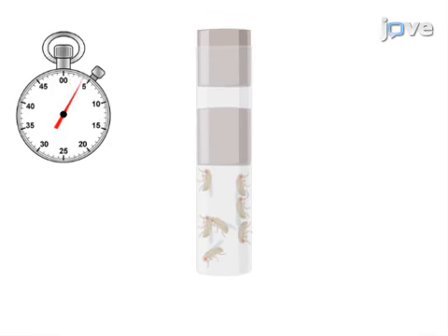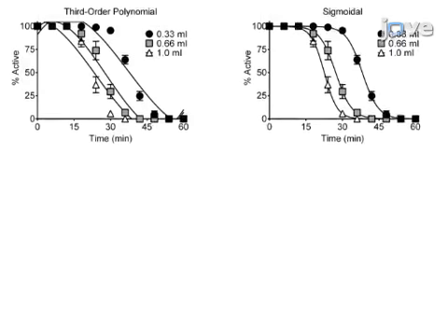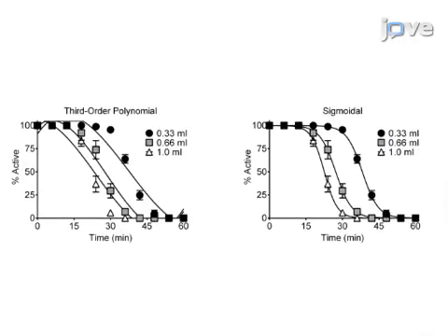The second step is to determine the number of flies that are sedated in each vial at recurring time points until all of the flies are sedated. Next, the time point is interpolated when 50% of the flies are sedated for each vial. The results show an index of the time required to sedate fruit flies with ethanol.